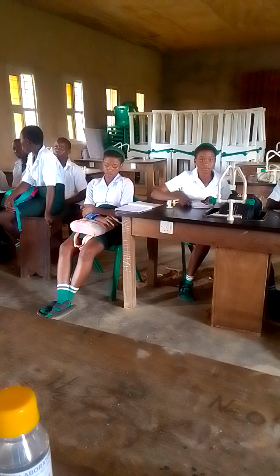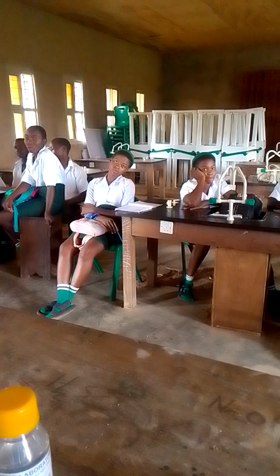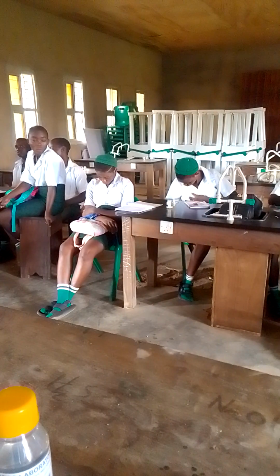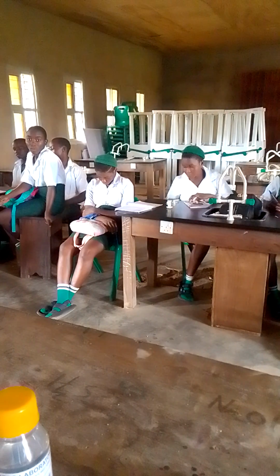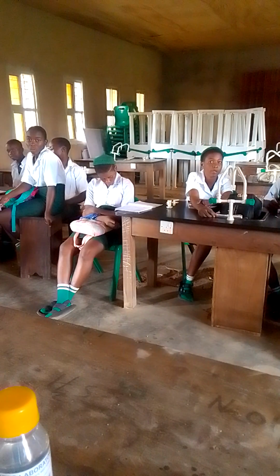So therefore, whether the compound is soluble or insoluble, totally dissolved, partially soluble or insoluble, anyone you see with your two eyes, you write it there. Oh yeah, start the work now.